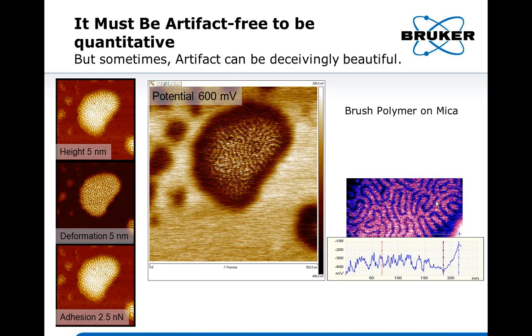But the resolution is high there. Then we wondered how true this is. We know that frequency modulation KPFM really is based on how much the frequency will shift if you have an electrical force gradient between your tip and sample. Now the way we measure the frequency difference is we don't measure the frequency directly.